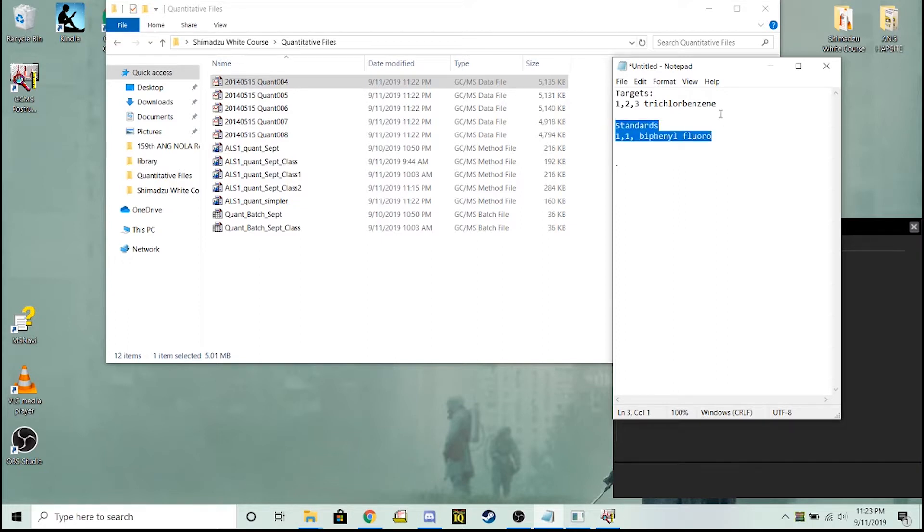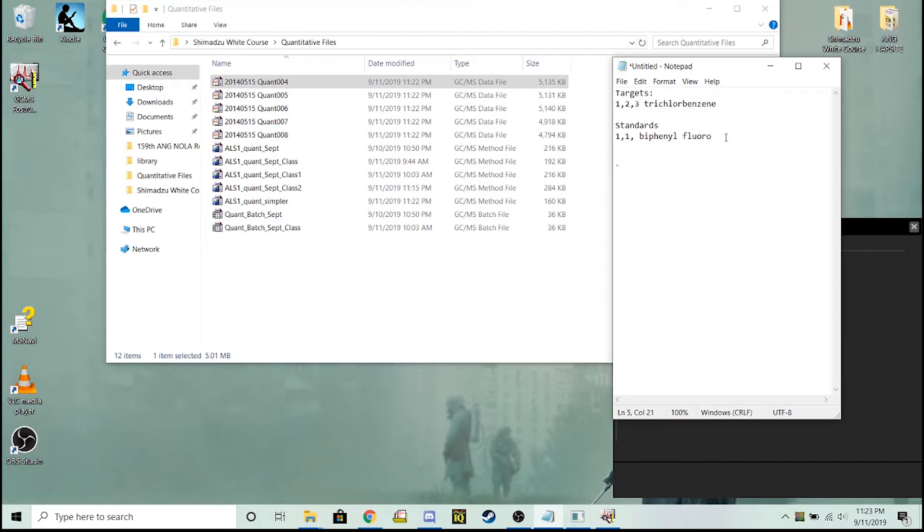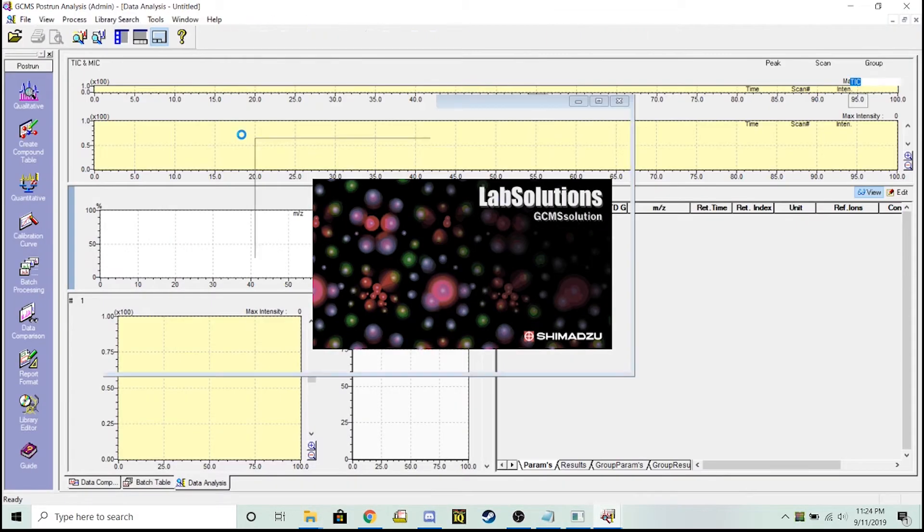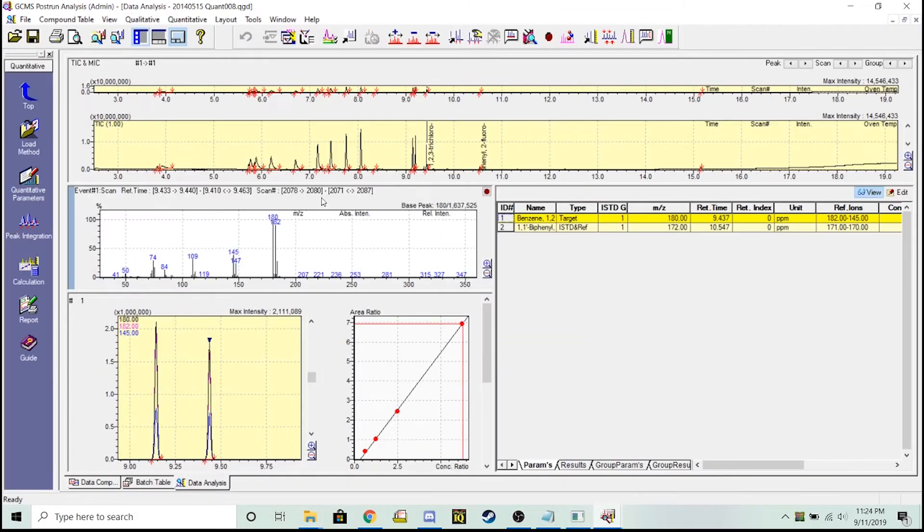You can use your QCS for this, but I'm choosing one chemical from the QCS. This internal standard is going to be at about 8 ppm. We'll let the method know that once we get there, but I start by opening my most concentrated data file to run my peak integration for all ticks.